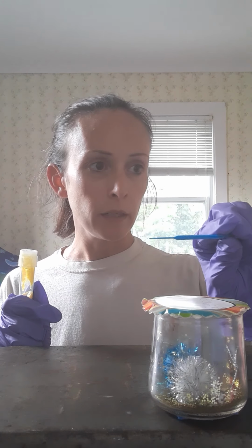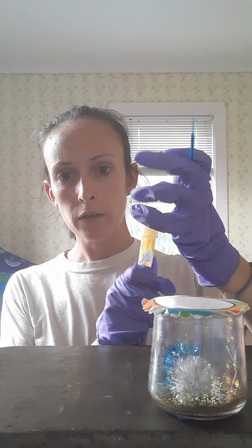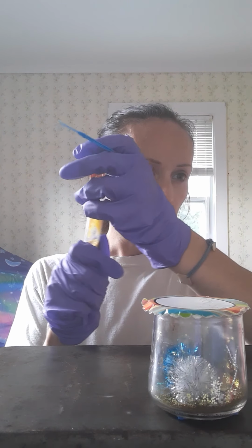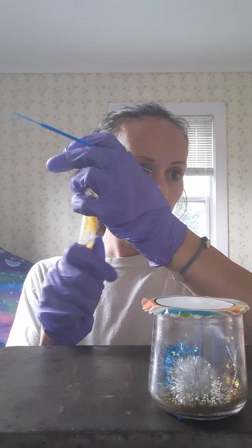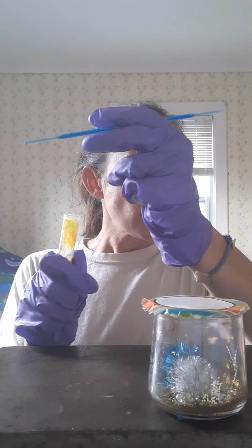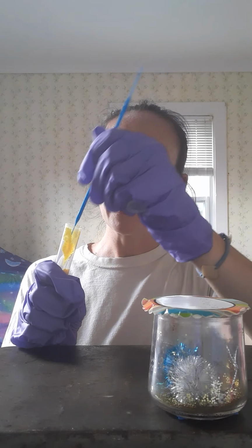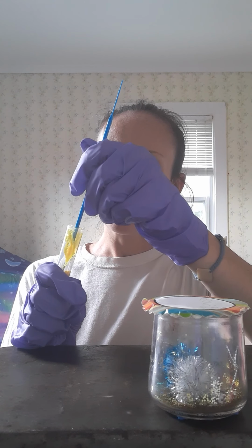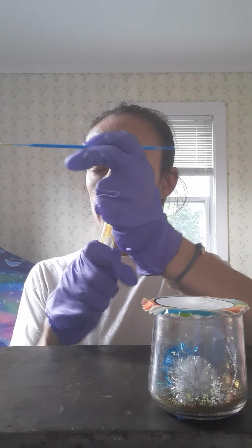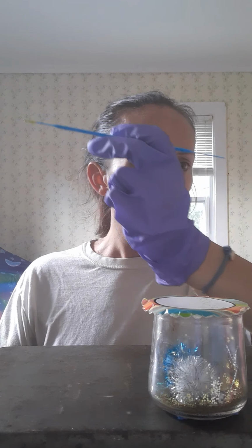Hold it there for a minute. So to open this, we're going to open it with the top with our pinky finger. And then we are going to hold that in our pinky finger. So we're going to insert the loop into the culture and get a small amount. Be very careful with that. And again, replace the top, and we're going to put that back into our tube rack.